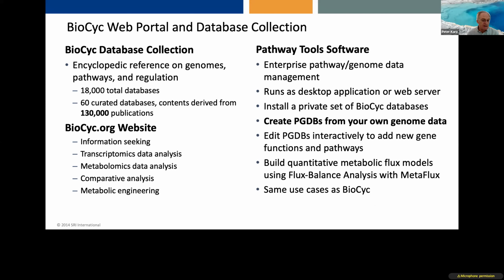It's also an enterprise pathway genome data management system, which means that, let's say your lab is sequencing a number of genomes, you can use Pathway Tools to analyze those genomes and to store the data locally in your organization.